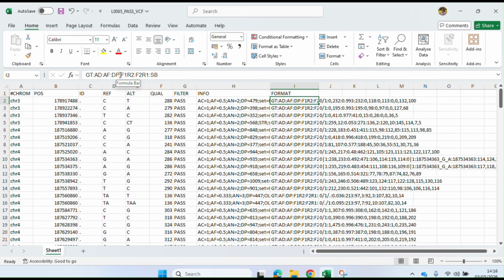For example, for my PhD project, I worked on the allele frequency and DP. I filtered my variants based on allele frequency and depth. For the allele frequency threshold, based on other researchers and other references, I put 5%. So any variant which has an allele frequency of more than 5% I considered a valid variant. Otherwise they could be sequencing errors, so I just filtered them out. For DP, my threshold based on other studies was 100. So if the variant is present on 100 reads, that could be considered a valid variant, not a sequencing error. So this is what I considered for my project.